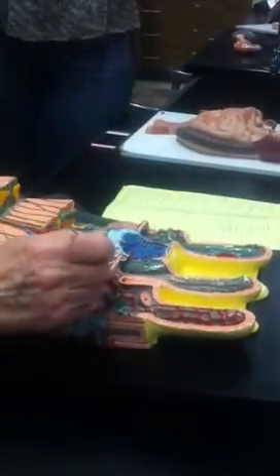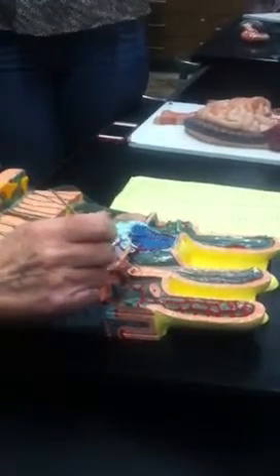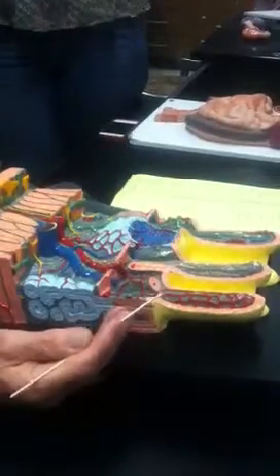The ones at the top of the hill are dying. They've been abraded by crumbs and nuts and particles and stuff we've eaten and the digestive juices and so on. So the cells start to die as they march up. By the time they get to the top here, they get sloughed off. And then any enzymes inside contribute to digesting the food in here. But at any rate, down here, the Paneth cells are involved in immune function, but this is also the reproductive area. And the cells march up and fall off.